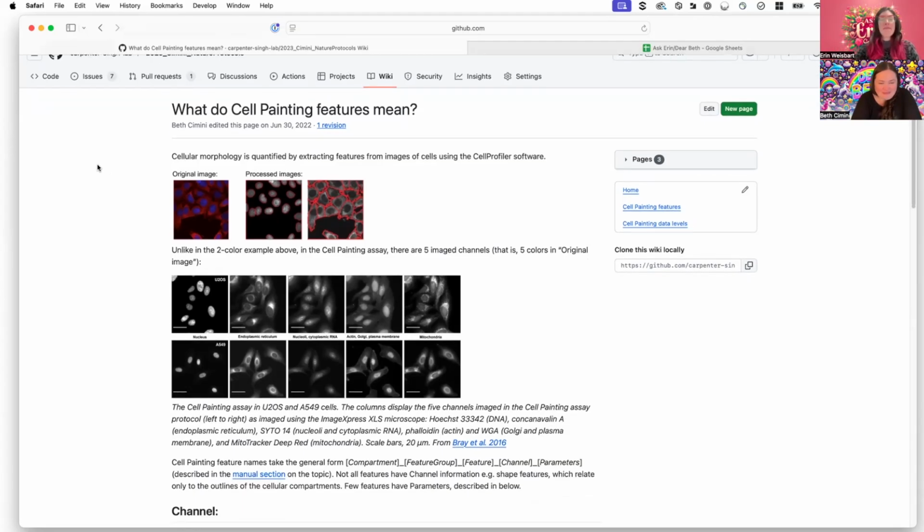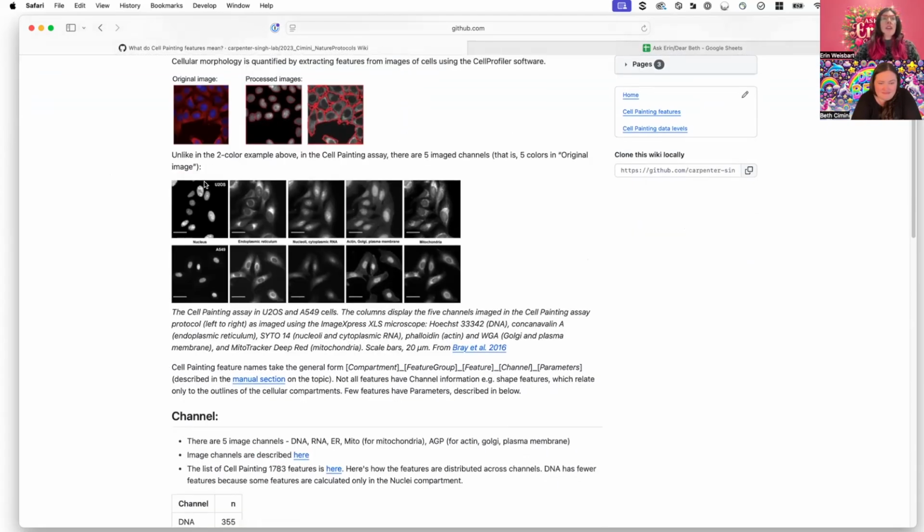Okay, here we go. If you need a refresher on the cell painting assay, go check out that episode. We'll drop it in the show notes. But basically, as a reminder, we have pictures of cells, we identify nuclei, we identify cell bodies, we define the cytoplasm, which is the cell minus the nucleus, and then there are a number of channels that we are making measurements in. So we are identifying the cell, for example, and then making a whole series of measurements using that same object.